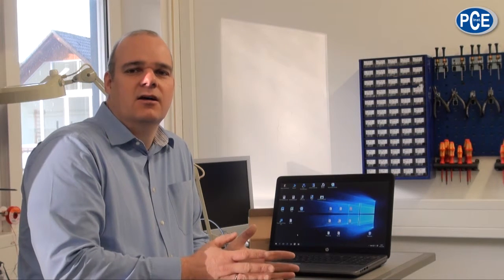As I said, we can measure from 6 days to 60 days. We have 32,000 measuring points which we can save. What makes it good is that it saves every 5 minutes for the 6-day model and every 10 minutes for the 60-day model. Those are the intervals at which the temperature is saved.